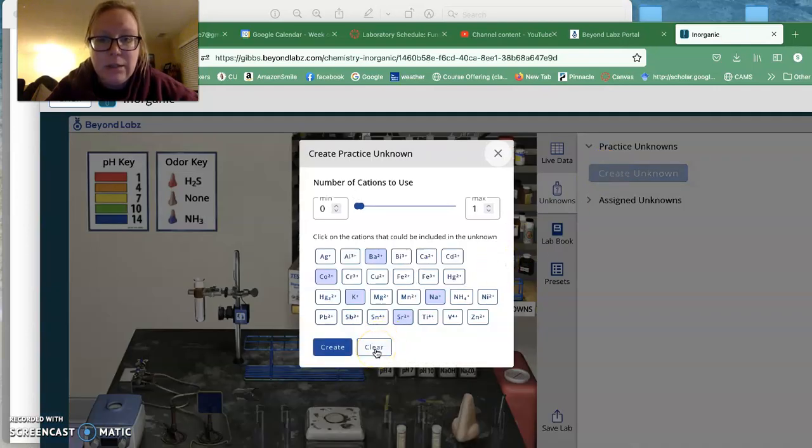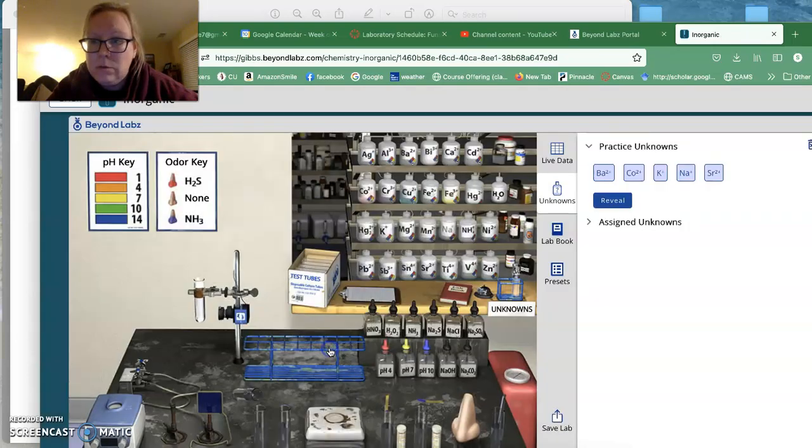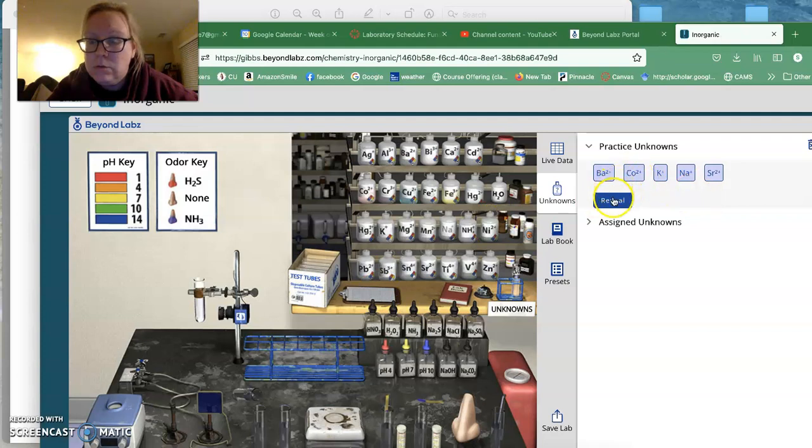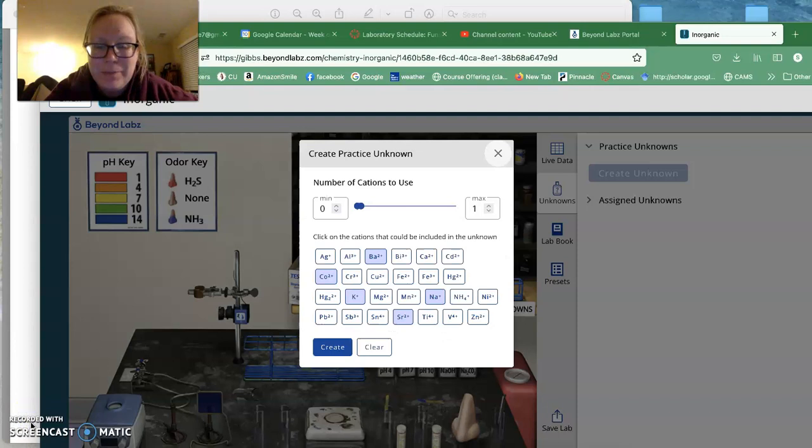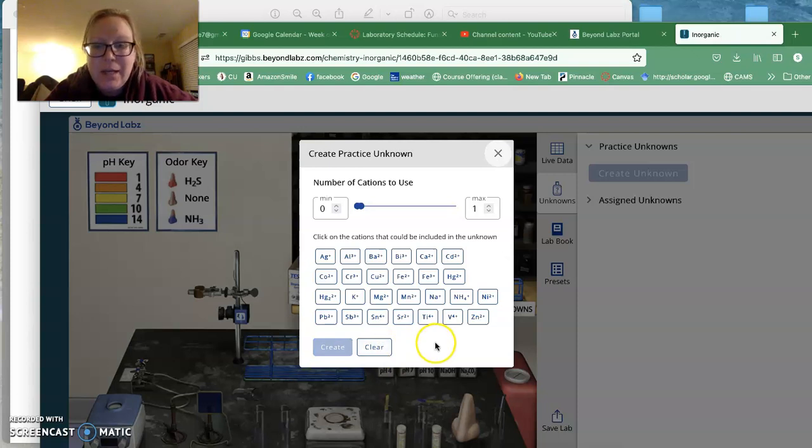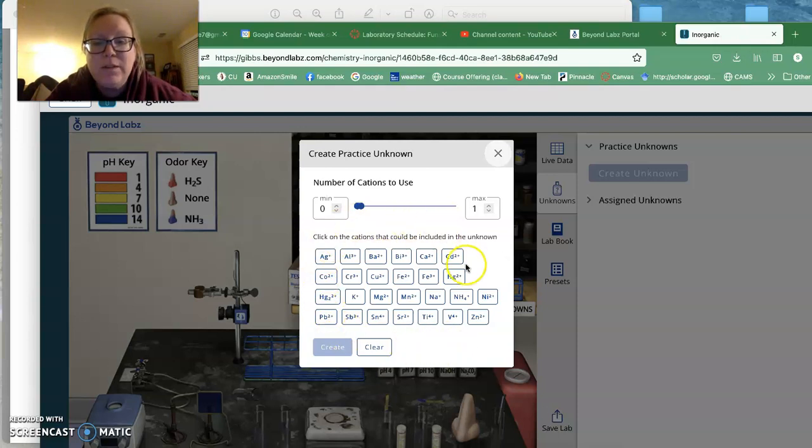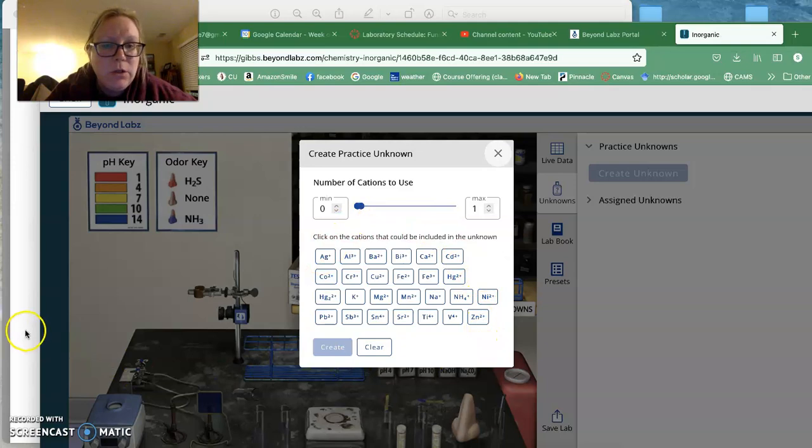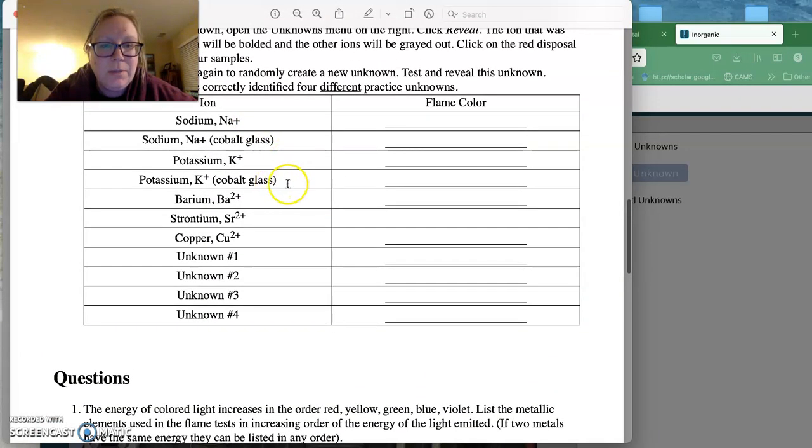I want you to clear this. So I want you to come here and I want you to clear this. And I want you to look at all of the ions here. And what you're going to do for your four unknowns is you are going to find, you are going to look and test four different things. So you are going to choose something that's not sodium, potassium, barium, strontium, and copper.